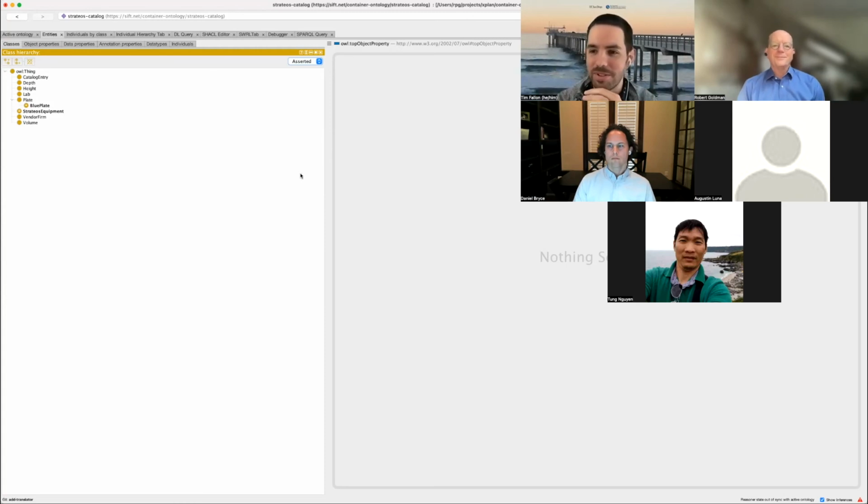So yeah, I'm trying to imagine how I can contribute my knowledge to this greater initiative, and at least separating the ontology concept more from the listing out catalog items concept seems to be a place where the ontology could be quite more complete, yet not have to necessarily list any vendor, beakers from Corning versus Amazon versus whichever. Yeah. Yeah. I mean, in practice, we keep them separate, right?